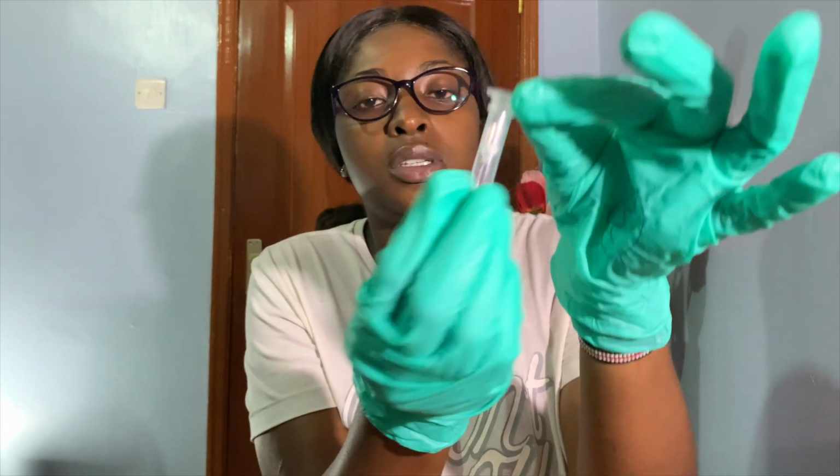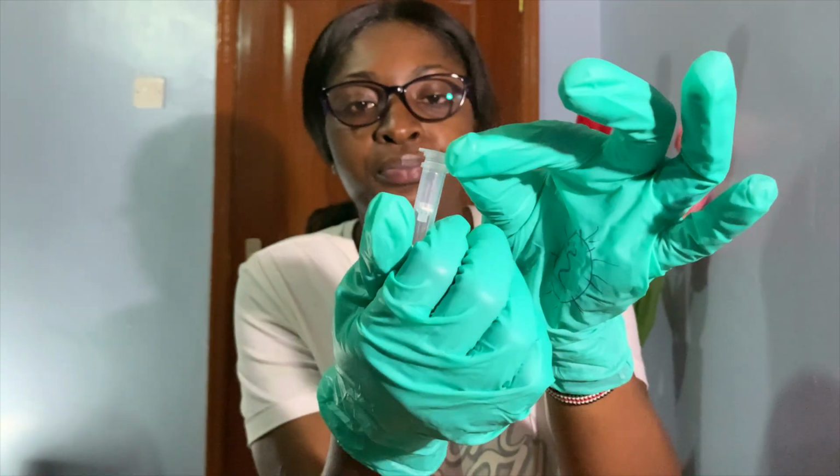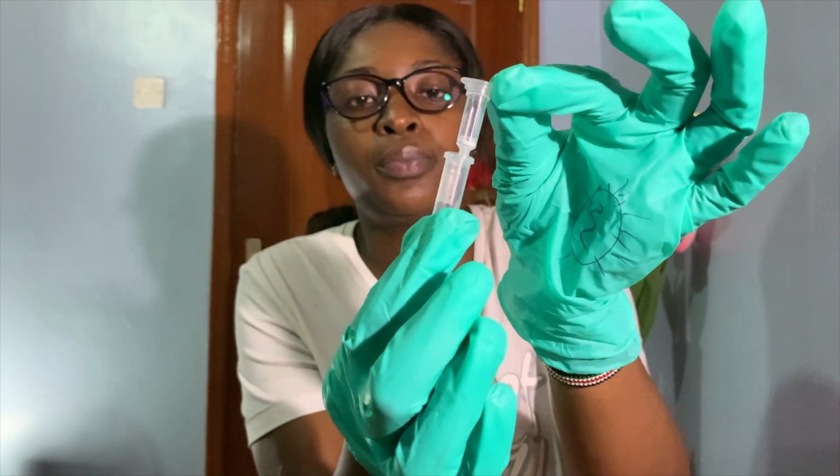Once it is exposed, we move that into another column called the spin column. I'll just show you how the spin column looks. So this is the spin column. It's detachable.